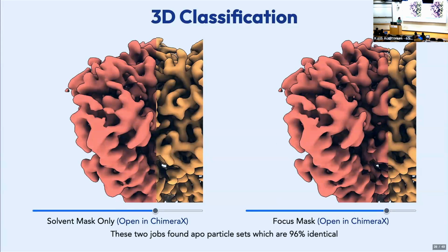And what that says to me is it could be any number of things. The 2 things that come to mind are, we know that the finger and thumb are pinching together, right? And we've made a focus mask around this part. We also saw in that morph that pinching together and apart is coupled with a global rearrangement of the whole structure. This makes sense because that ligand binding region has to transmit that signal all the way down to the TMD. So the whole channel is rearranging, and maybe forcing the rest of the channel to be the same in both classes sort of weakened our ability to tell the 2 apart.